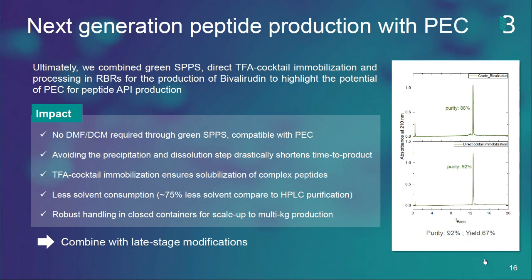And then the second question is, sorry, how many equivalents of amino acids were used during the solid phase synthesis with this green synthesis? Yes, so we used 4 equivalents of amino acids. 4 equivalents, okay. And what would be heating by adding pyridine in TFA in large scale? Pyridine. Yeah, I forgot to mention that what we have done is we have cooled the cocktail mixture, and we added pyridine slowly, drop by drop, to avoid any excess of heat production. Yeah, that is necessary. Okay. So you can cool the cocktail solution and add the pyridine slowly drop by drop.